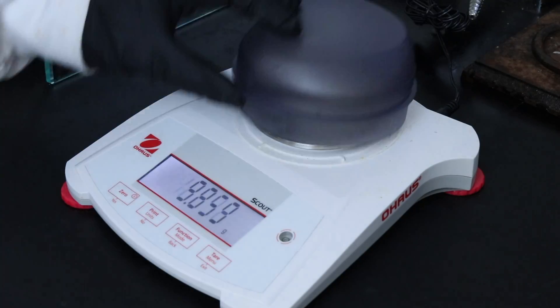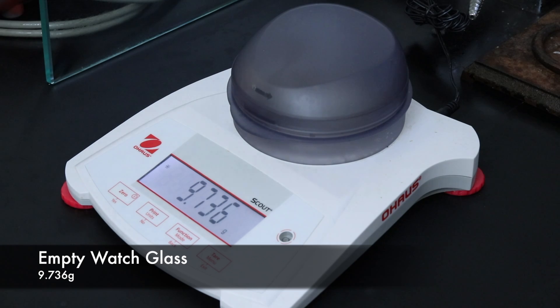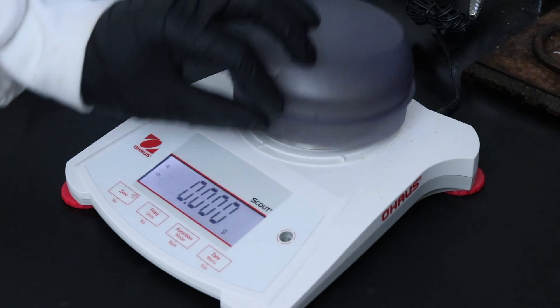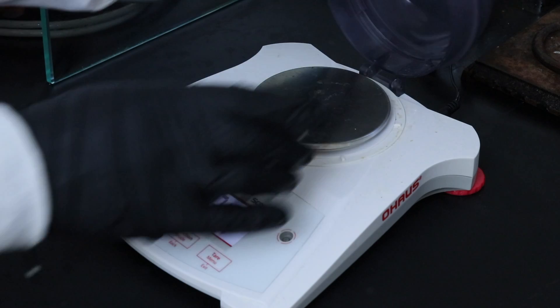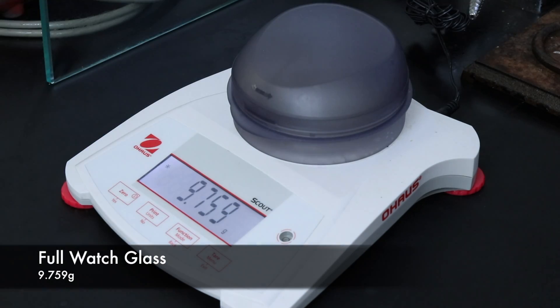Now I can weigh out the crystals to calculate a percent yield the empty watch glass being 9.736 grams and the full watch glass being 9.759 grams.